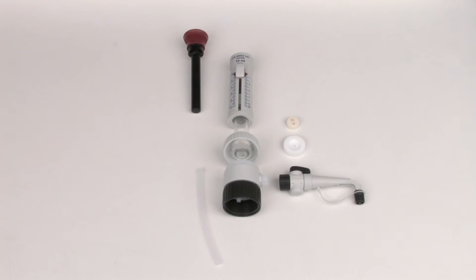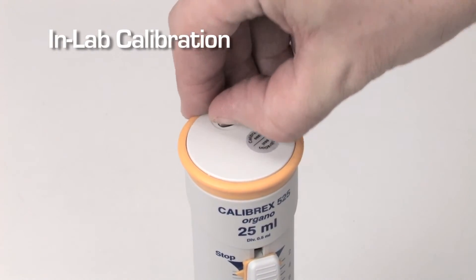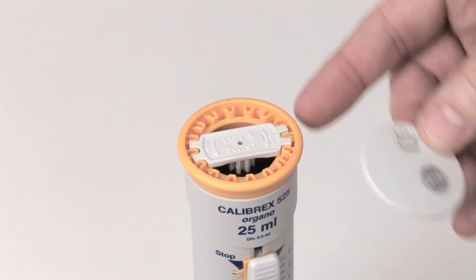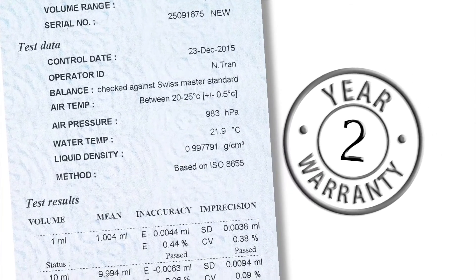Individual components are also available separately to be used as spare parts. If a new calibration is required, the calibration key is located under the cap. The operating instructions provide full details of the procedure. Each Calibrex dispenser comes with an individual QC certificate and an exclusive 2-year factory warranty.